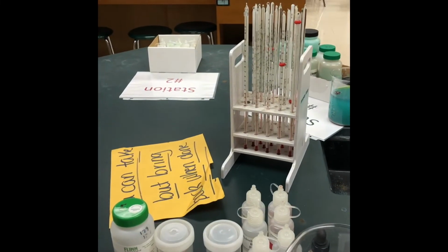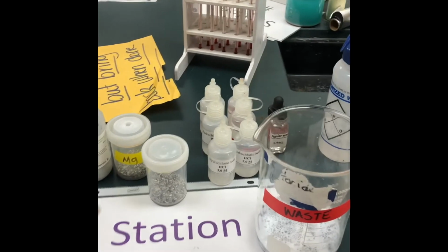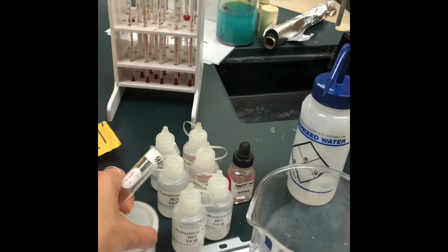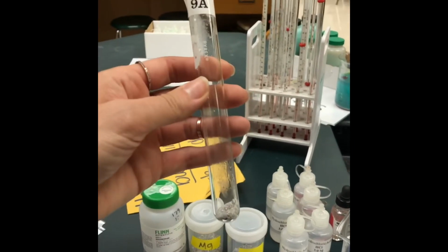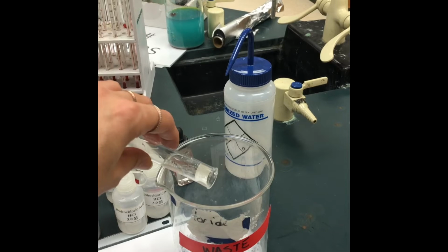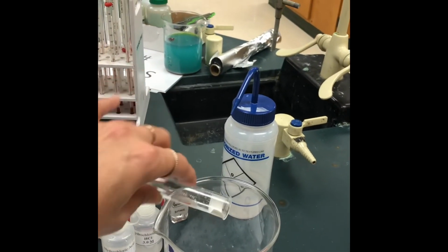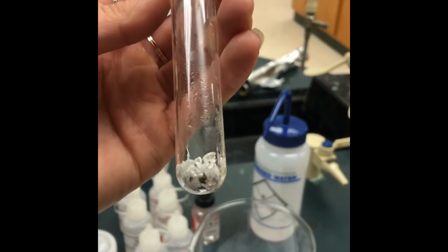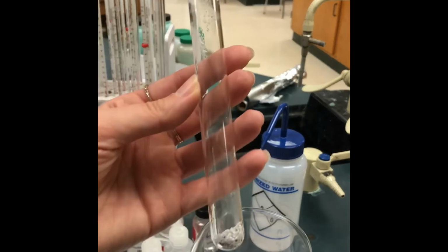Now, you are going to be adding your acid to your metal in a test tube. So, talking about disposal, after you're done adding your magnesium and your hydrochloric acid together, you're going to then need to dispose of the products that get made in your test tube. In order to do this, you're going to be using your disposal beaker. So walk over here and dispose of it. But as you see right now, I'm trying to dispose of my product, and it just kind of stays at the bottom. I can lightly clink, but nothing dislodges.